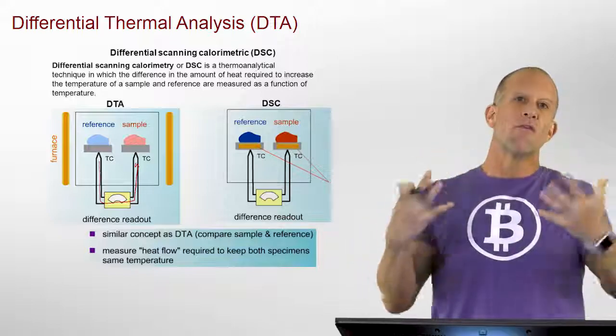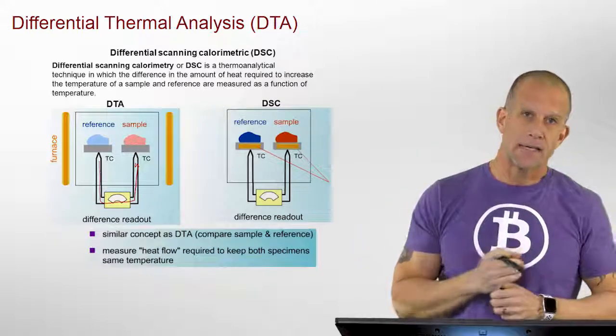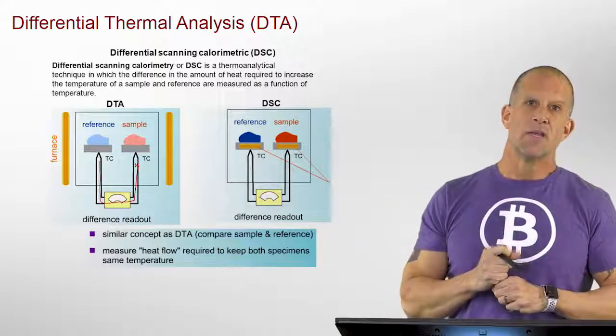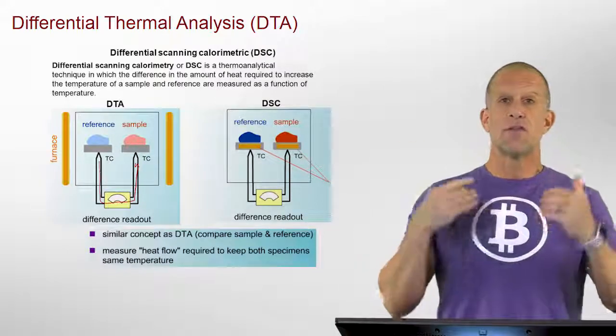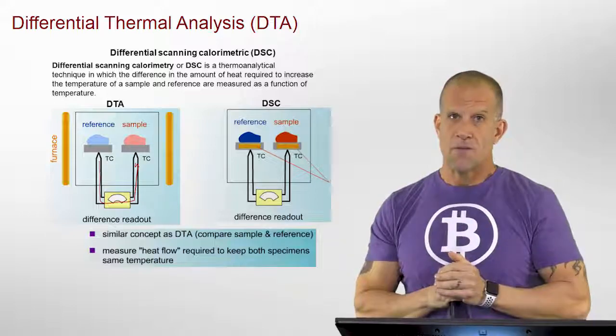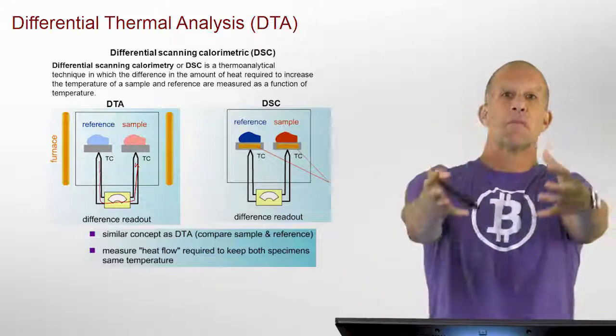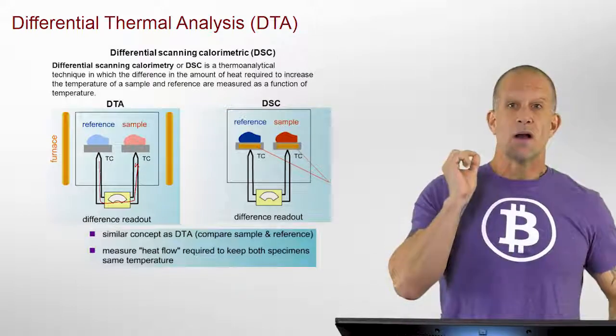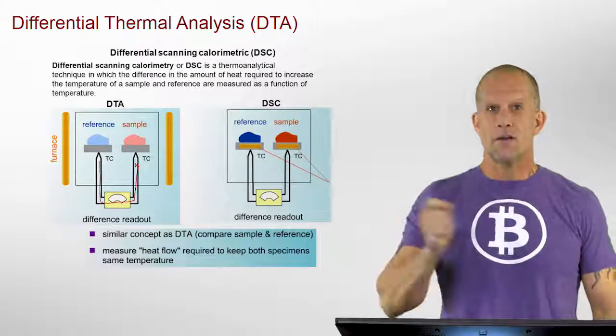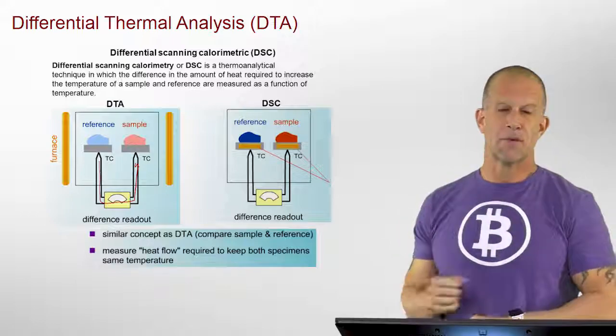So this overviews some of the primary techniques we use in calorimetry, which will hopefully help you when we look at specific examples of using calorimetric data, whether simulated, experimental data given to you, or data you collect yourself, to determine the thermodynamics of biological and chemical systems.